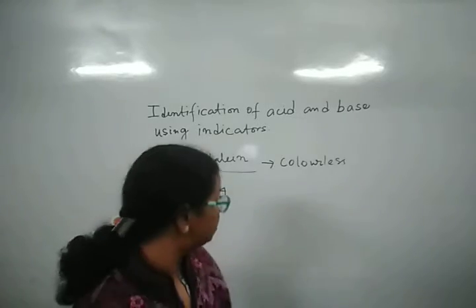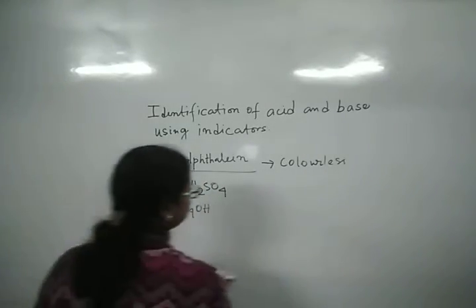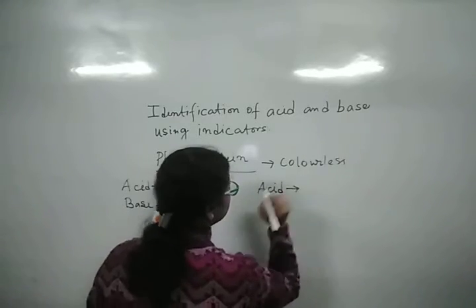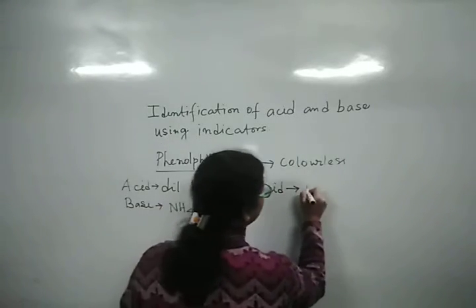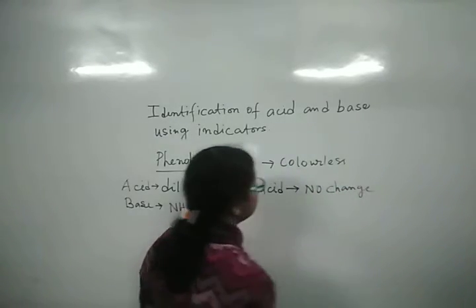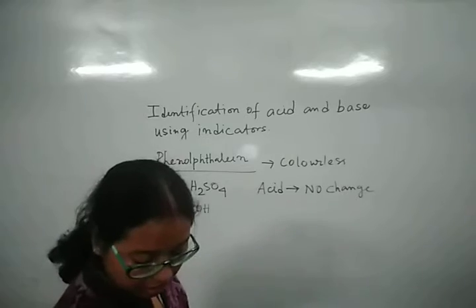So for acid, what can we write? Phenolphthalein, if we add this in acid, it will remain colorless, or no change we will say. No change of the color of the acid.